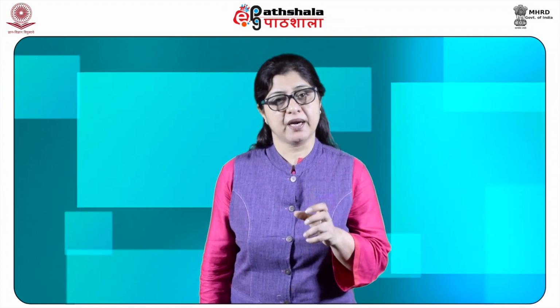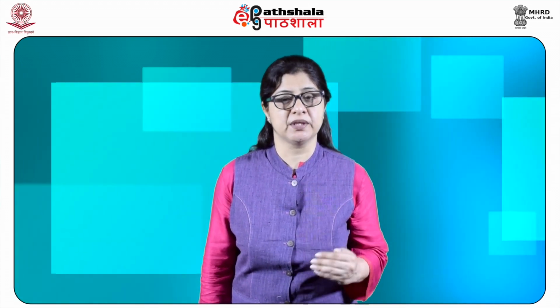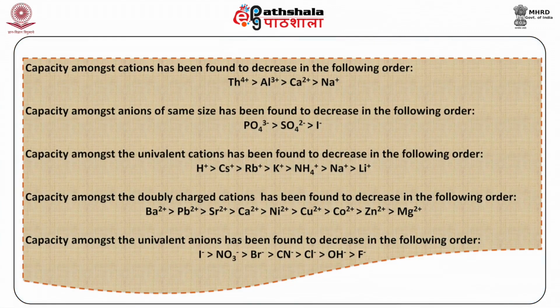If we compare hydrated ions of the same size, it is observed that the ionic charge plays an important role in determining their capacity to undergo exchange reaction. According to this view, the capacity amongst cations has been found to decrease in the order: thorium 4+ is greater than aluminium 3+, followed by calcium and sodium ions. Similarly, the capacity among anions of the same size decreases in the order of phosphate, sulfate and iodide ions.